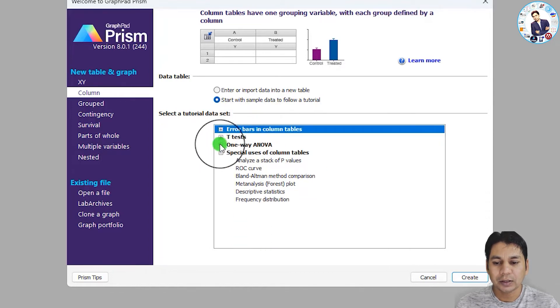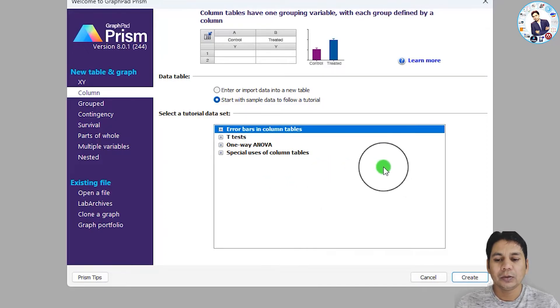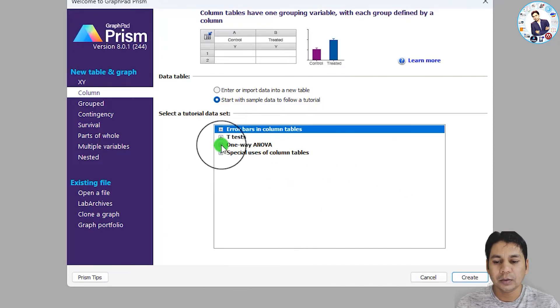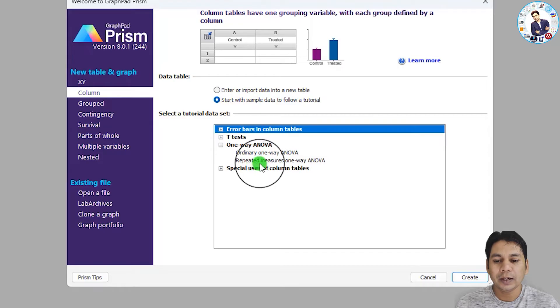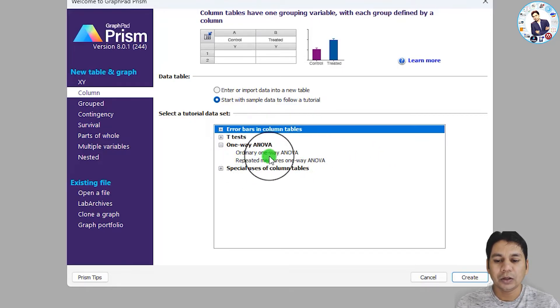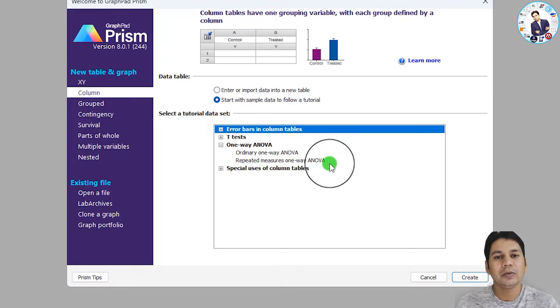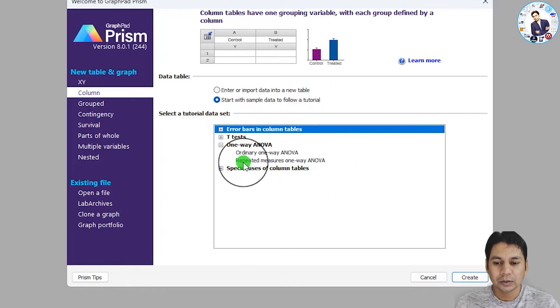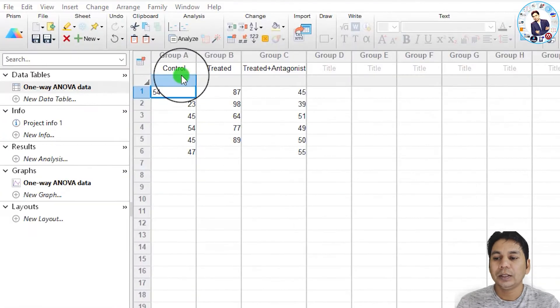If the options are minimized, click the plus button to expand them. In one-way ANOVA, there are two options: ordinary one-way ANOVA and repeated measures one-way ANOVA. Today I am going to discuss only ordinary one-way ANOVA, and I will discuss repeated measures one-way ANOVA later. Select ordinary one-way ANOVA and click 'Create'.